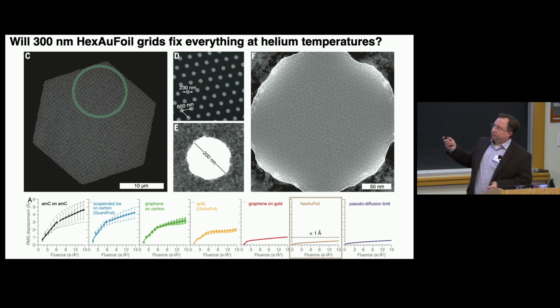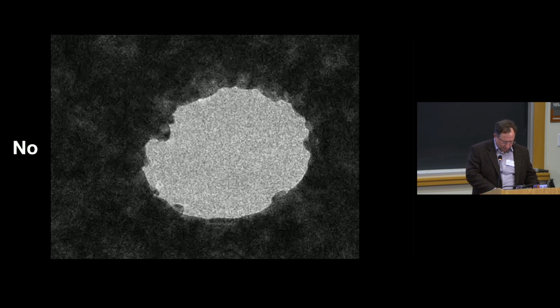Okay, so we spent years developing these things. Why don't we try these at helium temperatures? Does this fix the problem? Is the blurring of images at helium gone? Well, in short answer, no.